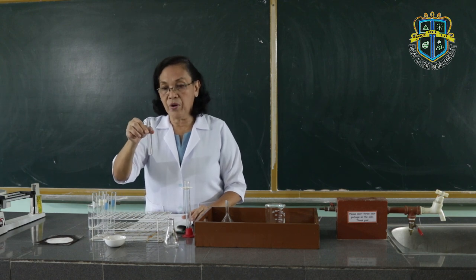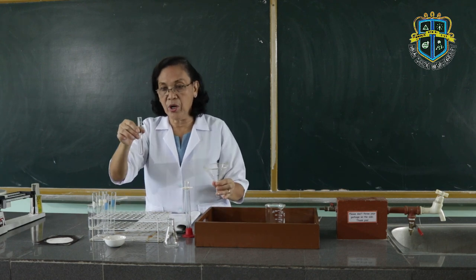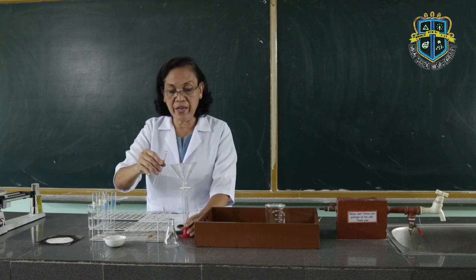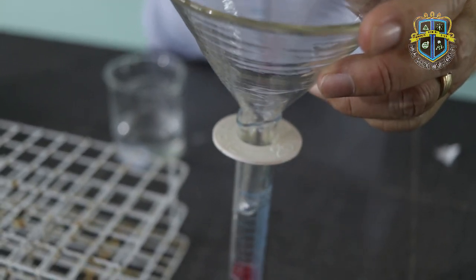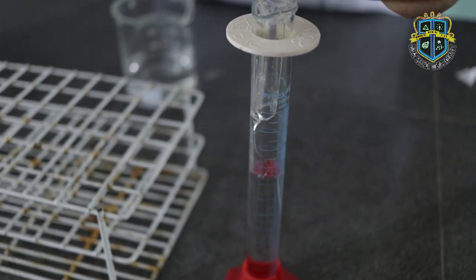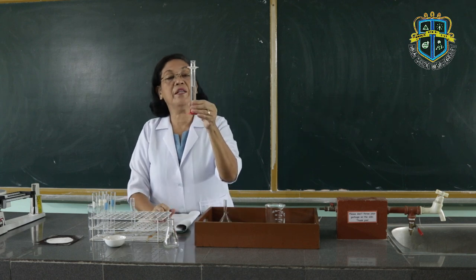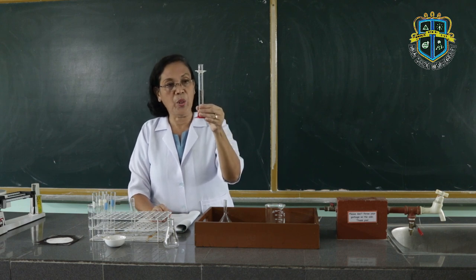I place the water up to the brim, then measure this amount of water in this test tube using the graduated cylinder. To make sure that the water will not be spilled out, you use the funnel. When you are going to look at the volume of the liquid, you have to focus your eye on the lower meniscus of the liquid.